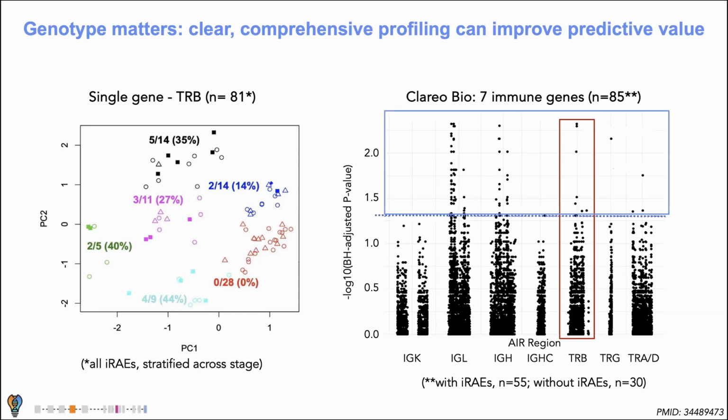But if you look across the genes, we see an incredible number of variants across all of the immune loci, or almost all of the immune loci we look at. Now, from our perspective, the more variants you can identify, the more potentially sensitive a biomarker discovery assay can be. So we were really excited about these results. Not only did they verify an older observation, but we think we have additional information to overall enhance some type of predictive algorithm that could be used for biomarker discovery to predict the likelihood of developing immune-related adverse events. But then we really wanted to pull these data apart and see how much content and how much explanation we can get out of just this variant analysis.